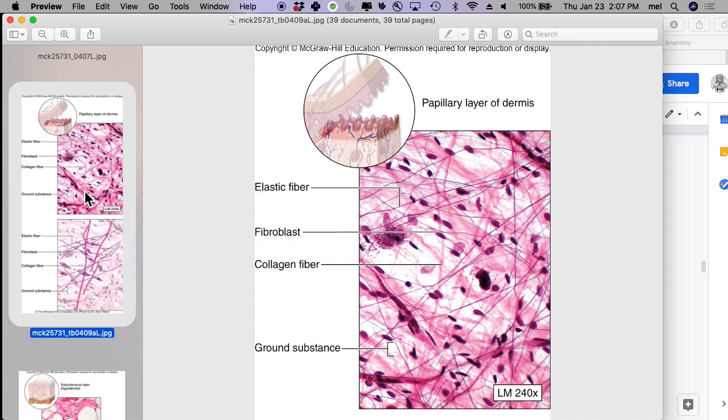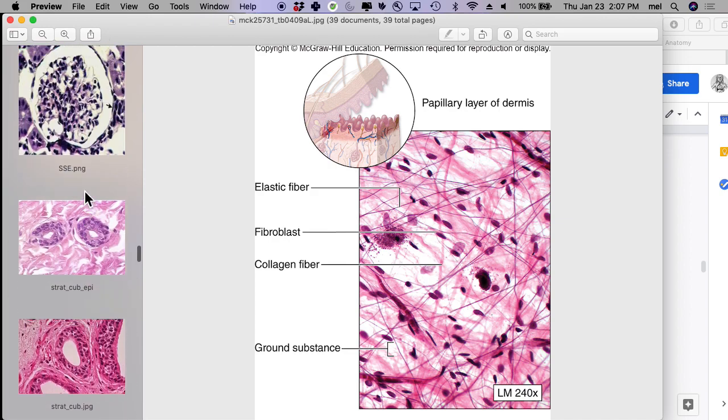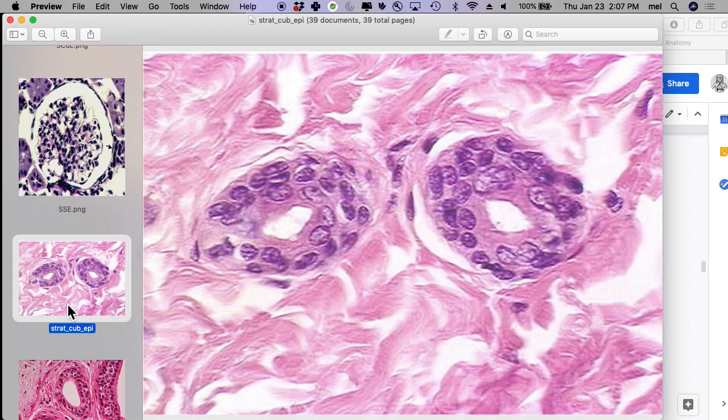A little weaker. They have fewer fibers in them, right? Okay. So that's sort of the difference between the loose and the dense connective tissues. So let me ask you on this slide, what is this tissue, loose or dense? It's actually dense. It's dense because I have big old chunks. I'm not saying I can't have any spaces, but most of the space is actually filled with fibers that you can see really packing the space.